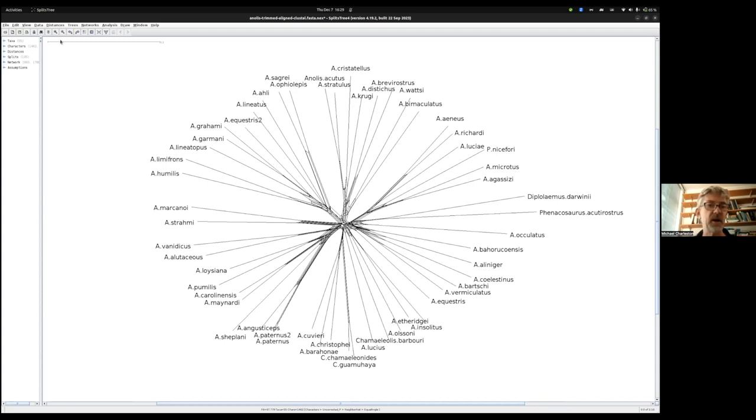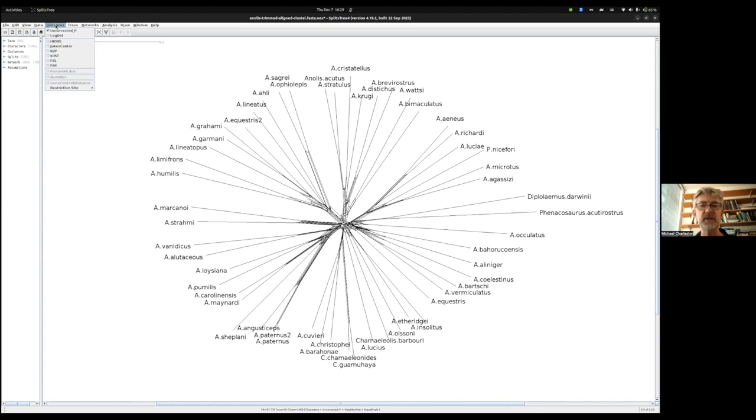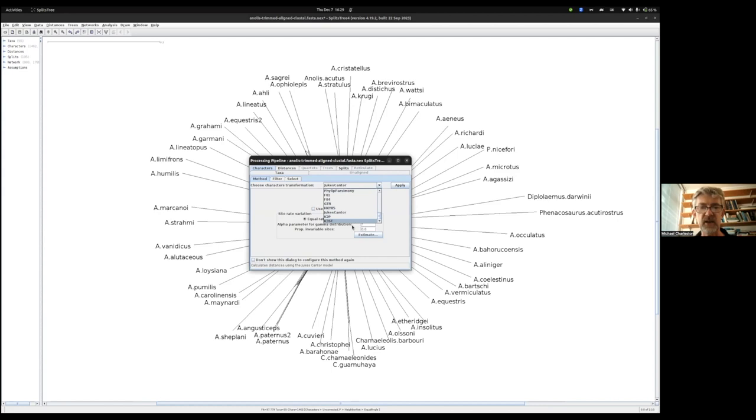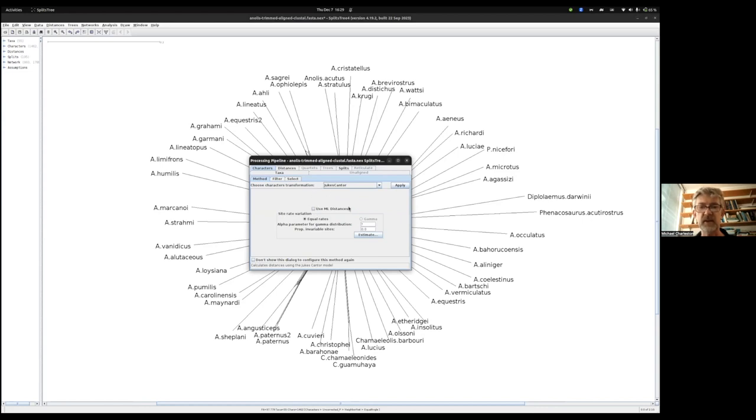I'm now going to change distance measure. We're going to go with our simplest of the substitution models, the Jukes-Cantor model. That's just one parameter. When I select that, a dialog pops up. I can select other options, but I'm not going to just for the tutorial. I'm simply going to apply.